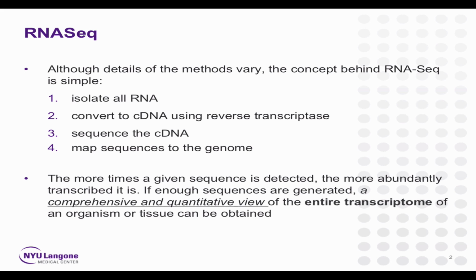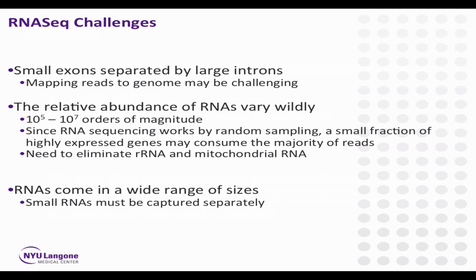And then, of course, Stuart is going to be showing you what to do with all those sequences of cDNA that you get and how to map them back to the genome. So it's a very comprehensive and quantitative view of the entire transcriptome, if you want, depending on the technology, but we have to be aware of a few challenges that have to do with RNA-Seq.